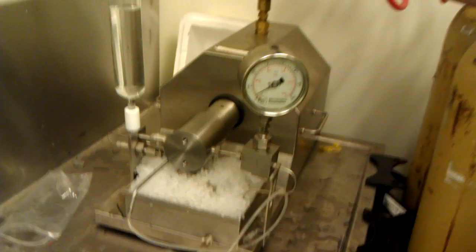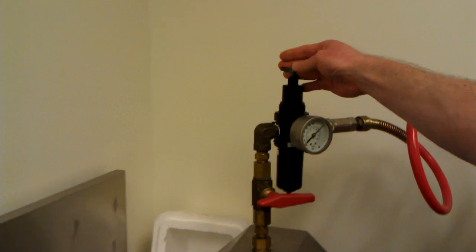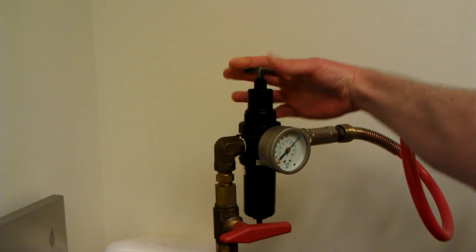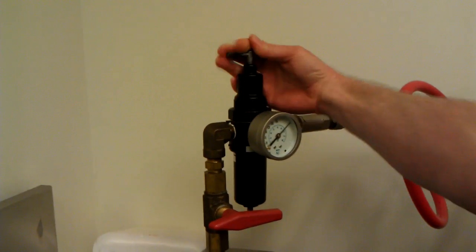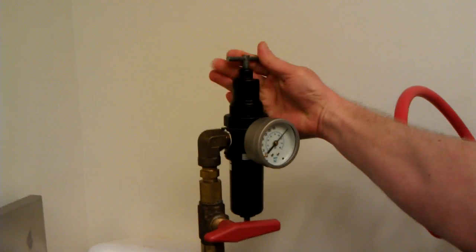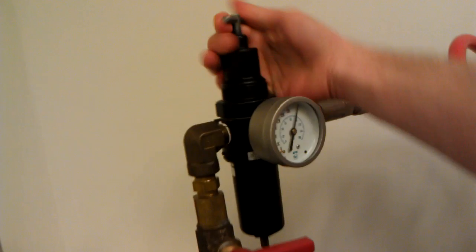You will adjust the pressure here using this lever. This one is set at about 30,000 PSI right now. Turning it counterclockwise you can lower this pressure, like I'm doing right now.